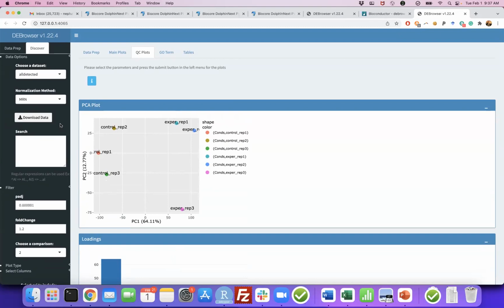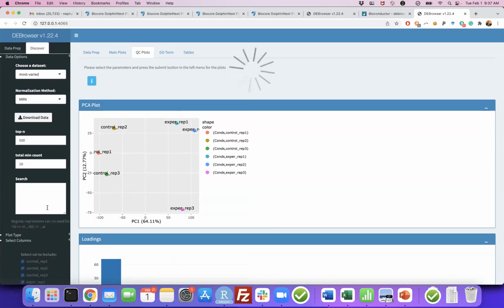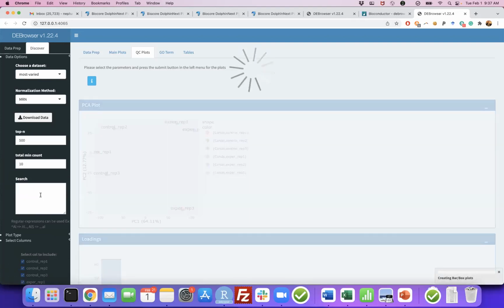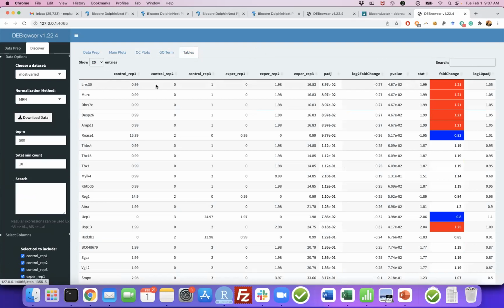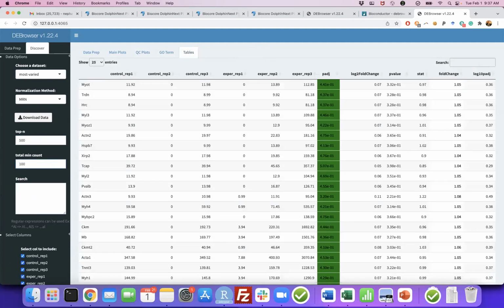And you can apply your differential expression analysis. This is post-processing QC, so we call it that. If you just want to draw the most varied genes, this is going to do the same thing PCA is doing. Actually, it's calculating the variance of the samples in this row, and it's just bringing the most varied genes into the list. You can change the top 500 most varied genes when the total minimum count is 10 in the row. So you can increase this value. These are all interactive. The table is changing now. You're looking at different parts of your data by changing these parameters.